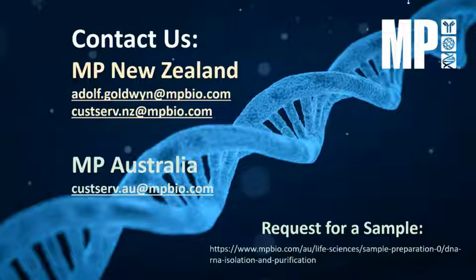So I see a couple more questions have popped in, Yongxing. Let's have a look at this. Somebody has issues with lysing of kombucha scoby. That's a new one for us. Would you like to give our attendees some advice on lysing kombucha?